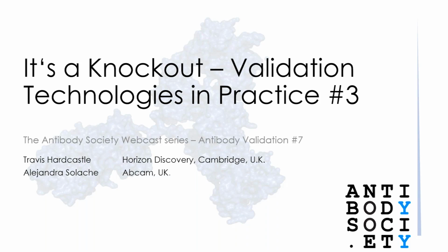We've seen in previous episodes that optimal commercial antibodies are both hard to find and to unequivocally identify, both at the point of sale and in the resulting literature. In any event, it's up to you, the users, to verify that the antibodies you use are fit for purpose in your experiments, and this always needs adequate positive and negative controls. The question is, what are accessible forms of validation technology to control antibody specificity?